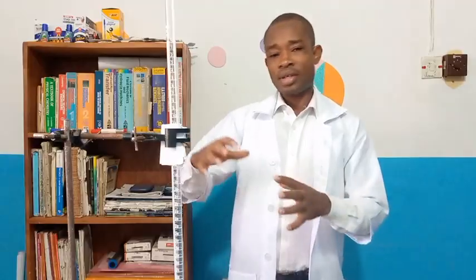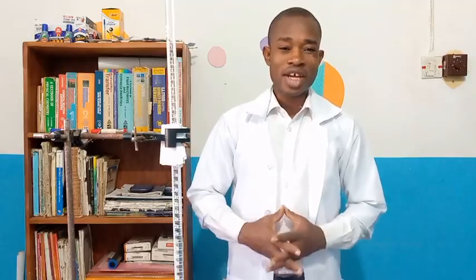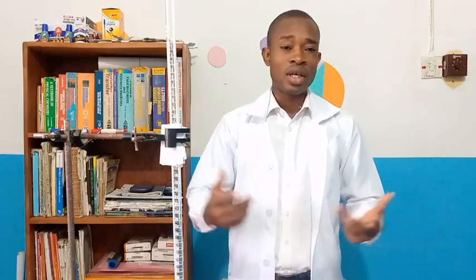I've mentioned acid and base as the solutions we need. Of course, our indicator, depending on the particular reagents, acid and base you use, may require a specific indicator. That is to help us determine the end point of the neutralization reaction. Indicators that are mostly used: phenolphthalein, we have methyl orange, we have bromocresol, and a list of them.